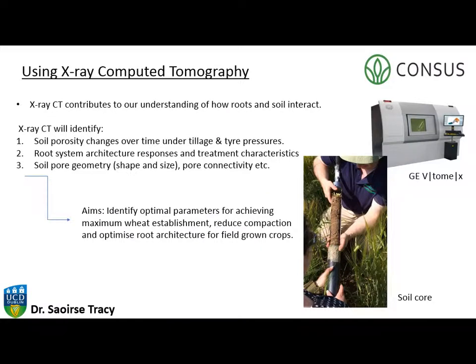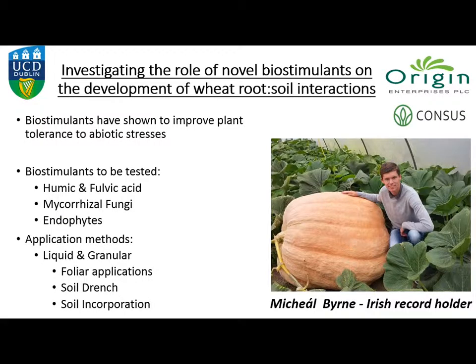So again, I'm going to quickly run through this using X-ray CT to pick out porosity changes over time, root system architecture responses, and then some pore shape characteristics as well. Again, he's sampling at the moment as well.